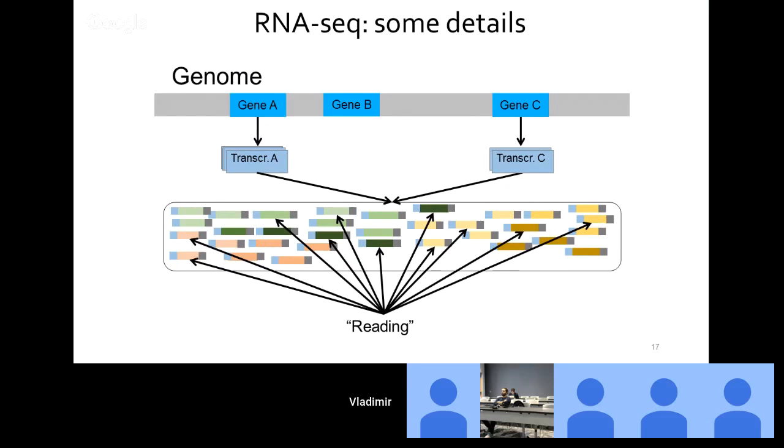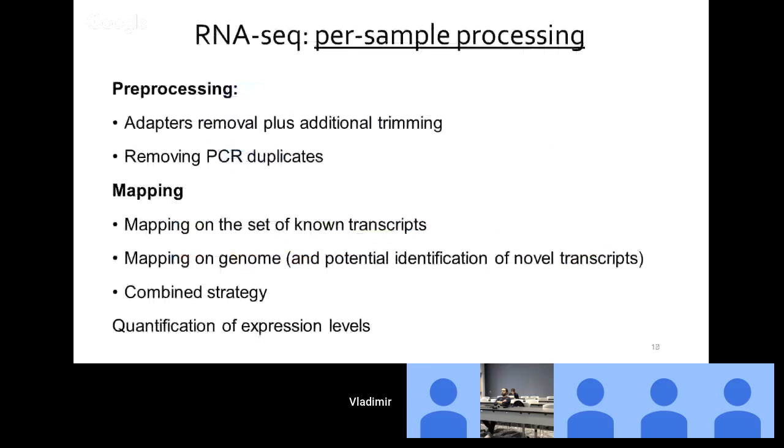So these short segments are read by a sequencing machine, and then the process is performed as we initially discussed. All these reads are mapped on gene sequences, and expression levels are estimated. So this technical pipeline gives us an insight into how we should organize a pipeline for analyzing the results of sequencing. What models should we use when we have FASTQ or FASTA files originated from a sequencing machine?